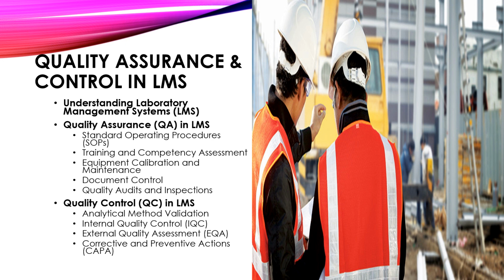First, quality assurance in laboratory management systems. Now, quality assurance in LMS focuses on establishing and maintaining processes to ensure that laboratory operations consistently meet predefined quality standards. It involves proactive measures to prevent errors, deviations, and inaccuracies throughout the entire testing and analysis workflow.